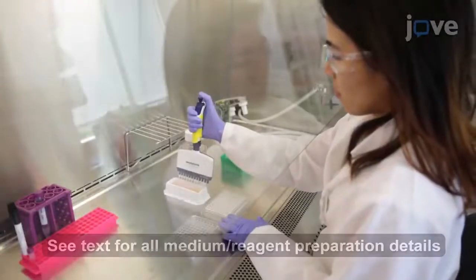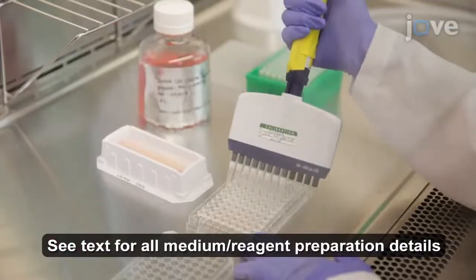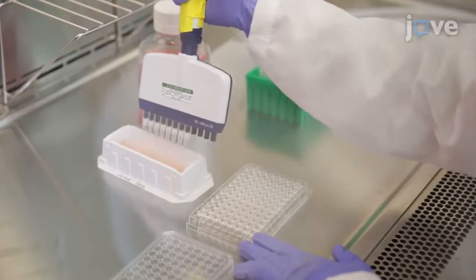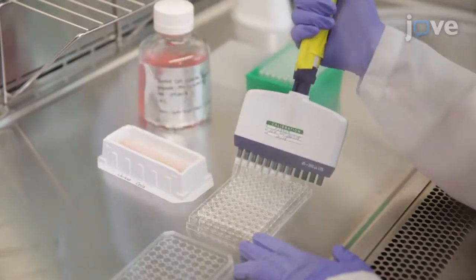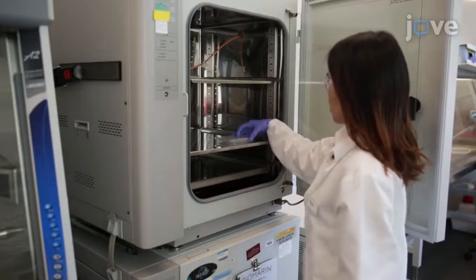To begin, seed 7.5 times 10 to the fourth Jurkat cells in 100 microliters of cell growth medium per well in a 96-well round-bottom cell culture plate for a 14 to 20-hour incubation at 37 degrees Celsius and 5% carbon dioxide with 95% humidity.